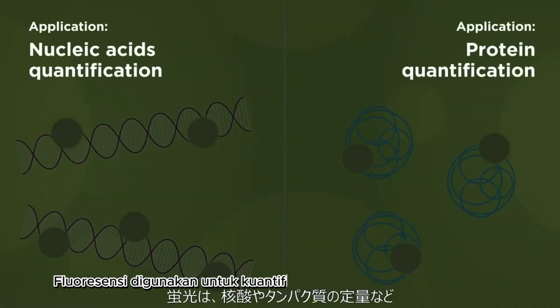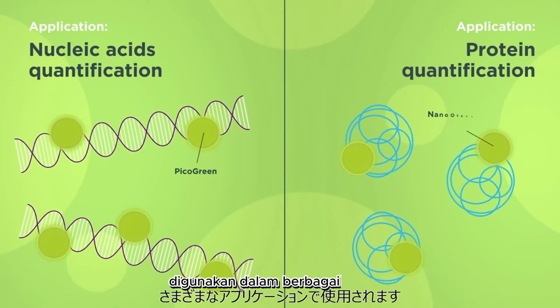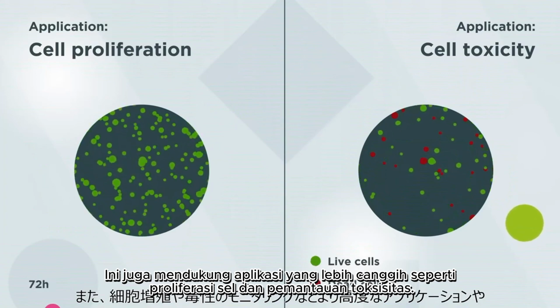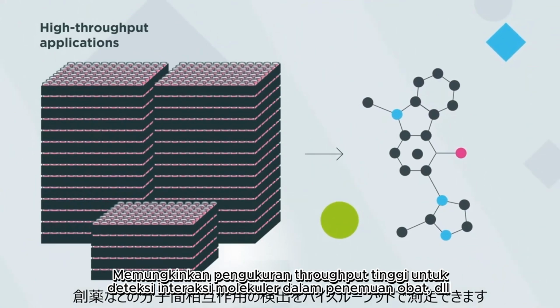Fluorescence is used for a variety of common applications, including nucleic acid and protein quantification, but also for more advanced applications like monitoring cell proliferation and toxicity, as well as high-throughput applications such as drug discovery.